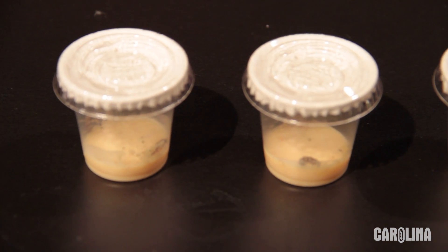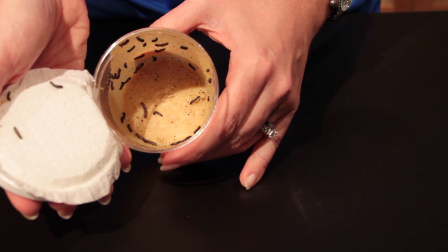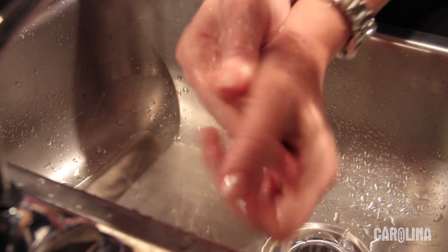You must set up an individual culture within 24 hours of receiving the larvae, because there is not enough food in the shipping cup to maintain them through the rest of the larval stage. Wash your hands with soap and water prior to beginning this process.